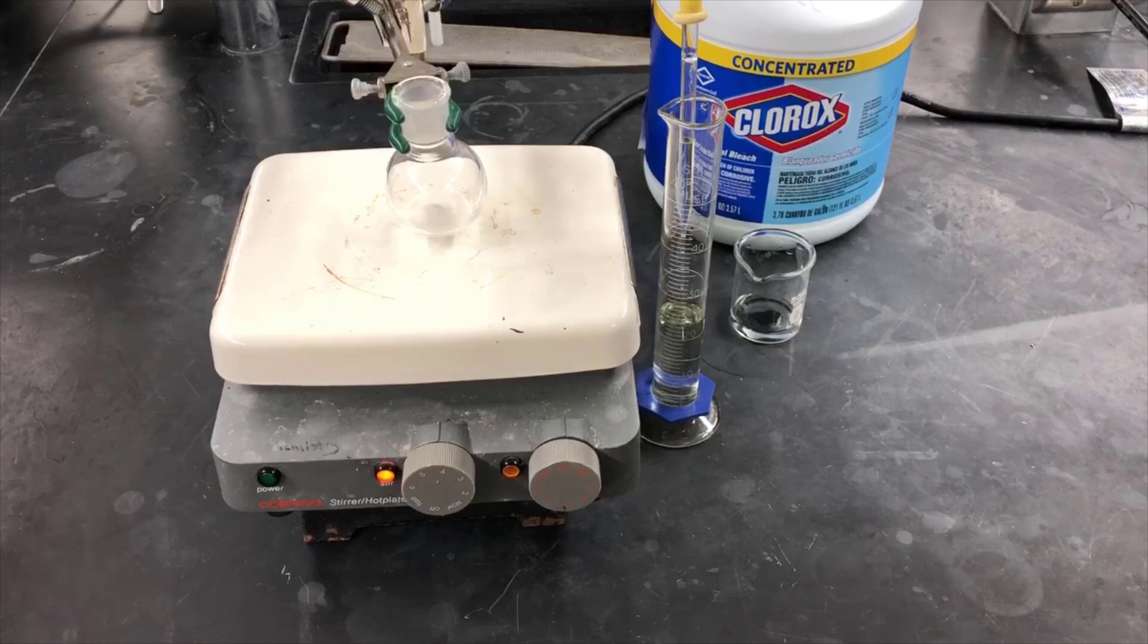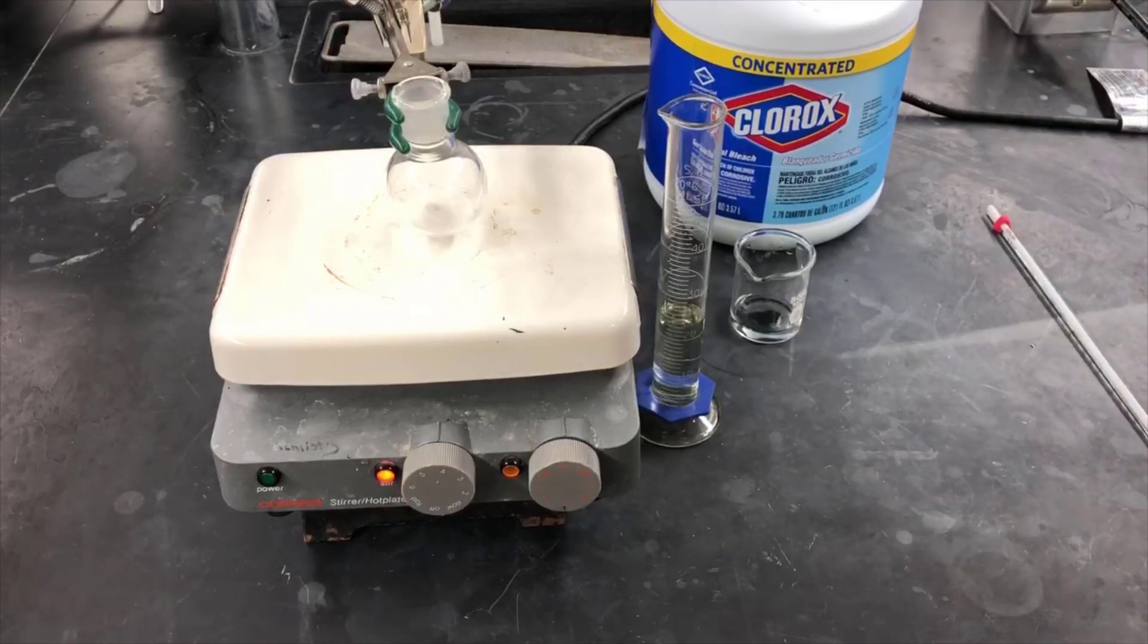You don't want to splash the solution around, and the stir bar and stir motor magnets can sometimes decouple. If the stir bar starts jiggling instead of spinning, you'll know you're going too fast. In that case, slow it down so you get the stir bar stirring again.